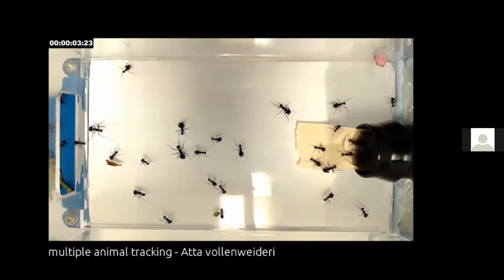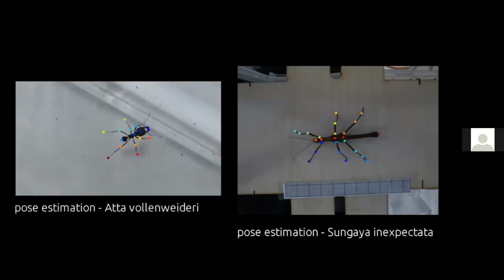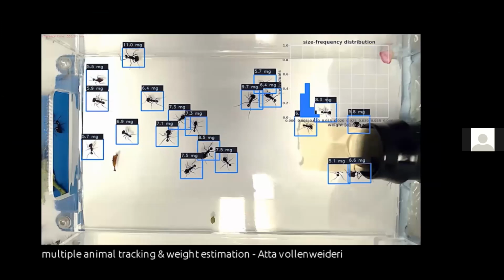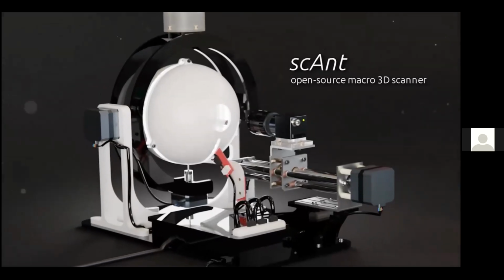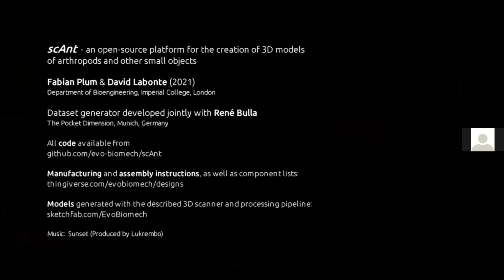Here are just a few examples. We can track animals. We can pose estimate with the data that we can generate. We can start estimating weight automatically from video recordings, so in particular polymorphous insects. And these are some of the things that we are trying to do with scAnt, but I'm sure other people have plenty of other ideas of how this could be useful.